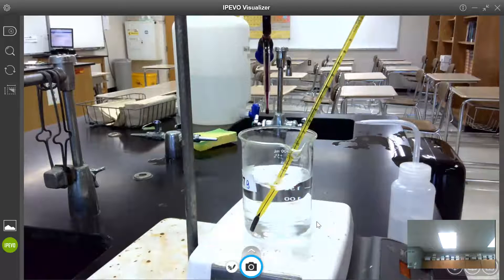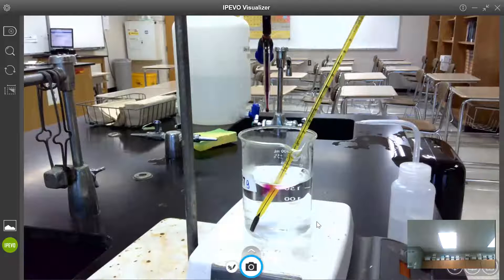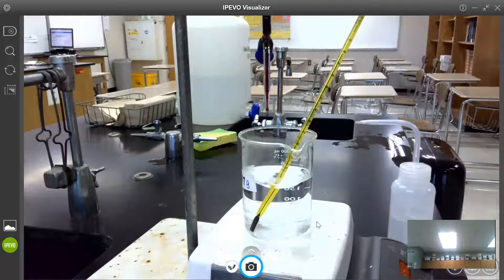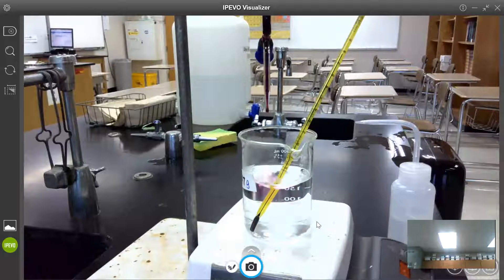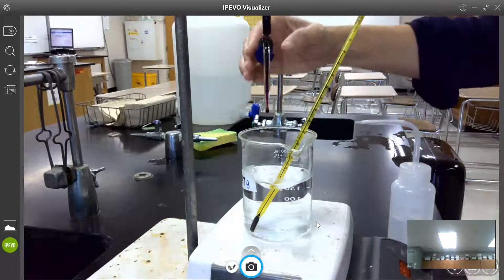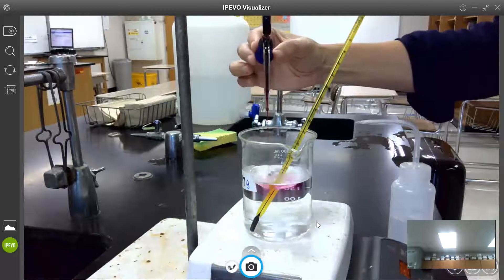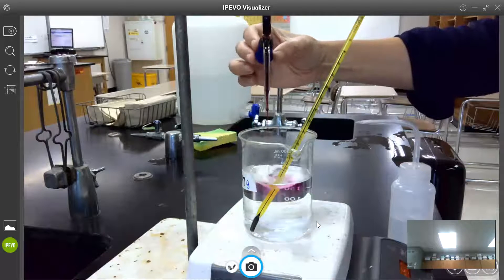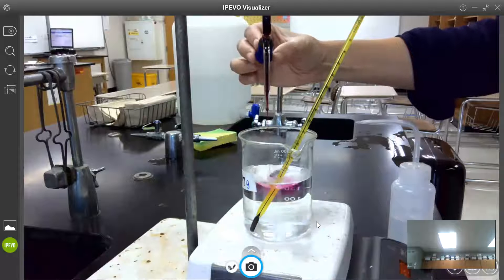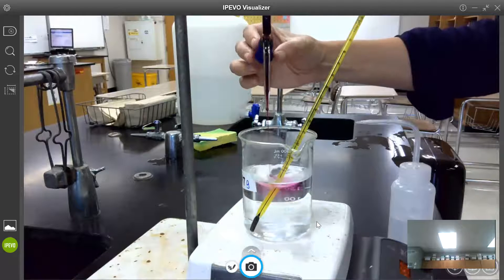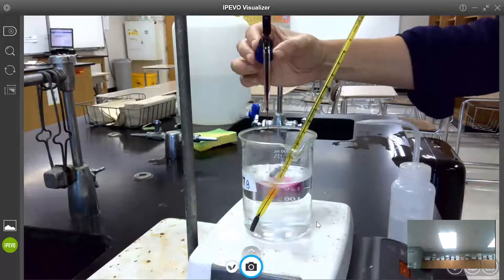Now I know from my calculation two that I calculated how much sodium oxalate I should use in order to react about 25 milliliters of my solution. So I'm going to open up the valve a little bit more and I'm going to add a lot of this solution almost 20 milliliters because I know that that can safely react with the amount of sodium oxalate that I have here.